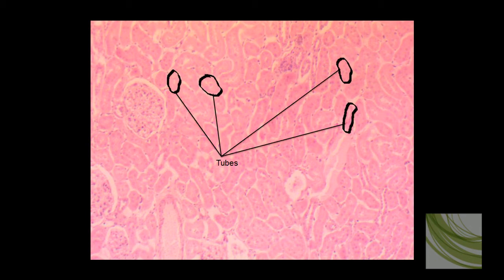Here I've outlined some of the tubes using the 10X objective, and we can see there's one and there's one. You still can't see a lot of detail — it'll become a little more apparent once we start using the 40X objective, but we're going to focus down on some of these areas.